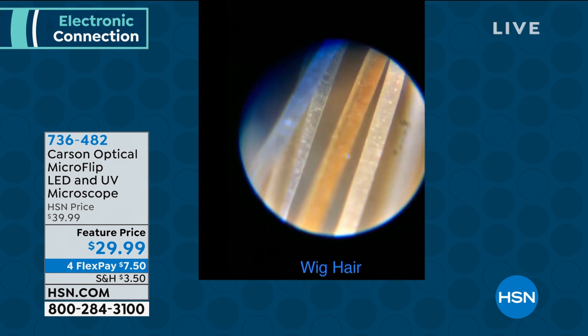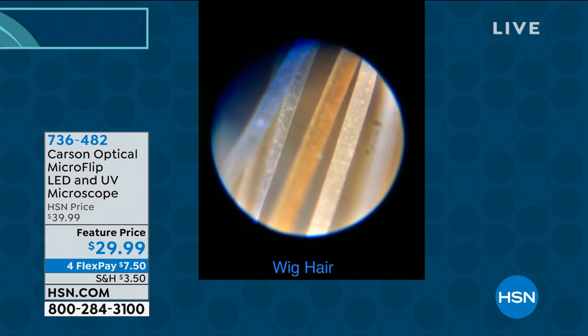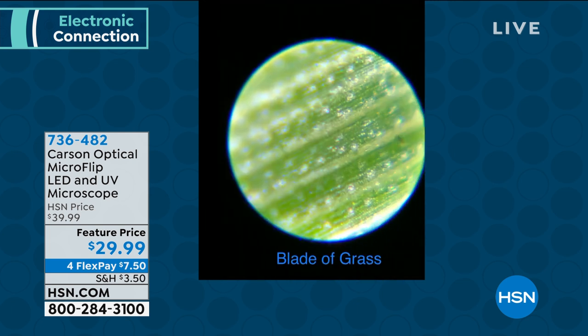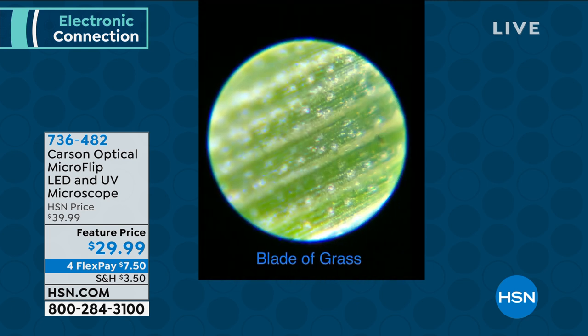So there's going to be little channels inside there. Look at that. Wig hair. You ever want to know what wig hair looks like under a microscope? You can. A cardboard, right? And you can actually see the little wood pulp fibers. I mean, that's something you can't see. A blade of grass, which is amazing. Truly amazing.